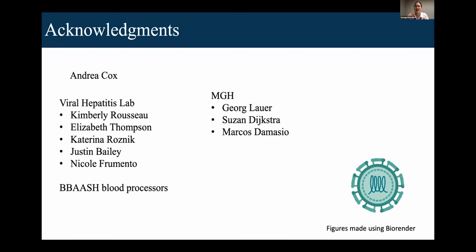The problem there was that I needed to be able to know which epitope went on which fluorophore. So let's say in the flu case, I needed to know that the flu epitope went to APC and the CMV epitope went to PE. If I was doing the traditional way of biotinylated pentamer staining, I wouldn't be able to know what went where. Sorry, I feel like I talk about this a lot, so it makes a lot of sense to me, and maybe not so much to everyone else. The pennies dropped. Pennies dropped. Yeah, exactly.